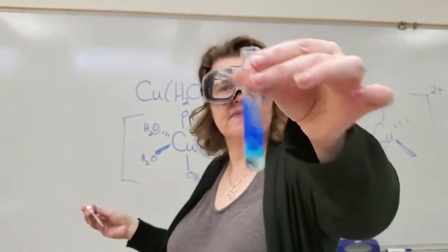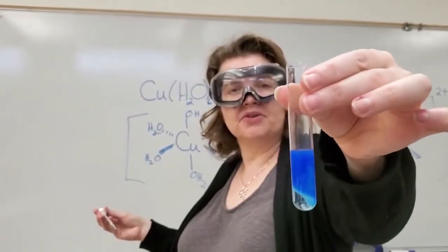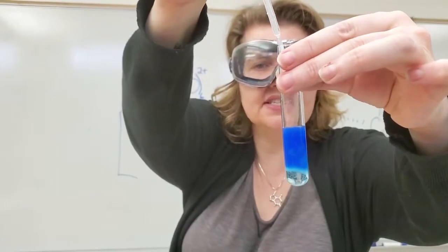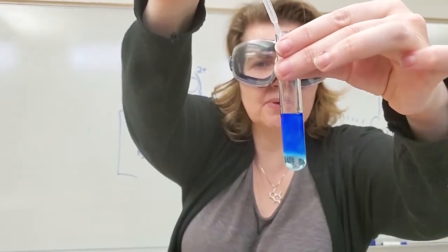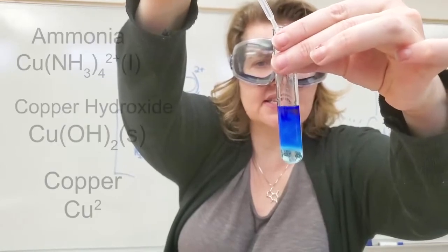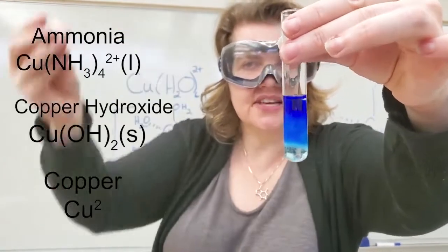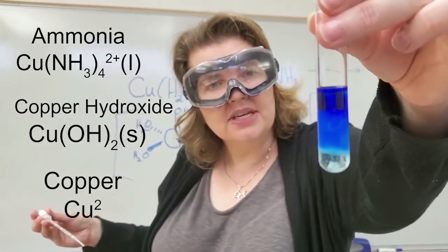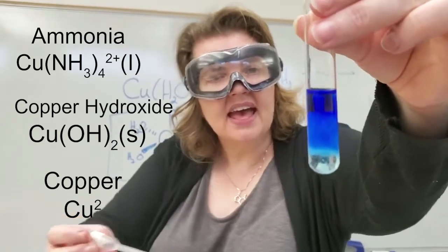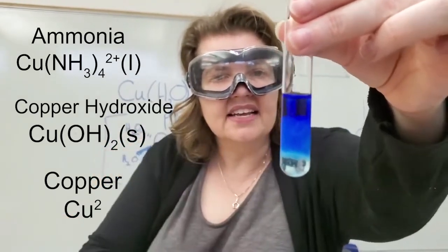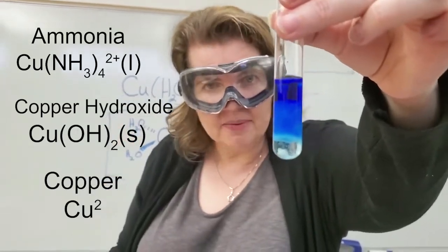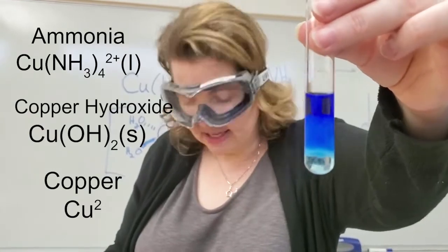Now I'm going to continue adding ammonia, and if I add an excess of ammonia, you can see the different colors that I'm forming here. I've got the copper hydroxide on the bottom, and this is ammonia that's now in large enough quantities that it's displacing the water as ligand in the complex ion. On the top we have the ammonia acting as the ligand, in the middle that is the copper hydroxide precipitate, and at the bottom there's still a little bit of copper ion with just water as the ligand.